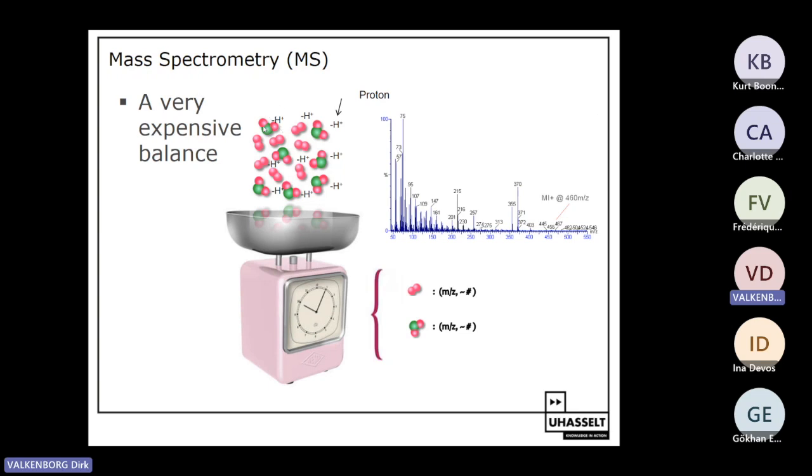So they now have a positive charge attached to the molecule, and that is the fourth state of matter. It's a plasma, or an ion in this case. So in my slide here, this is charged with protons. These are hydrogen atoms without an electron, so that makes it positively charged.